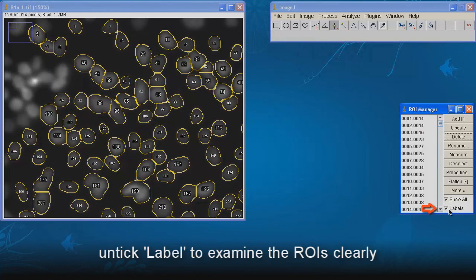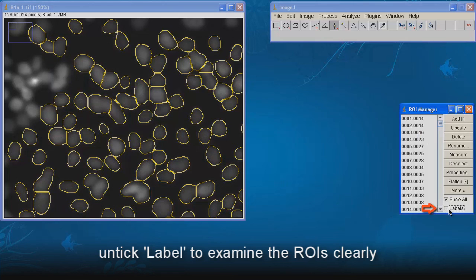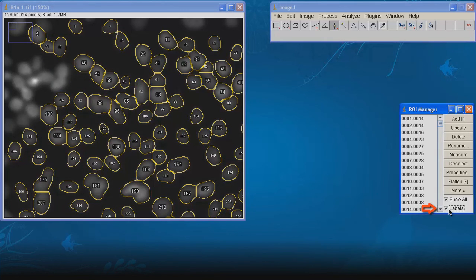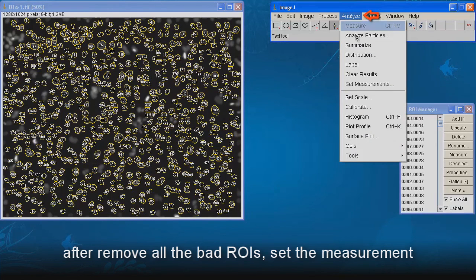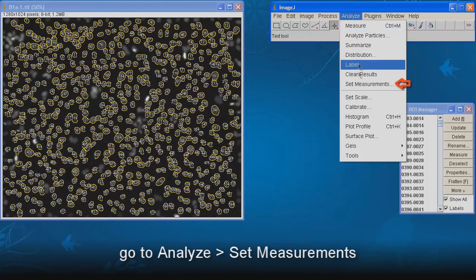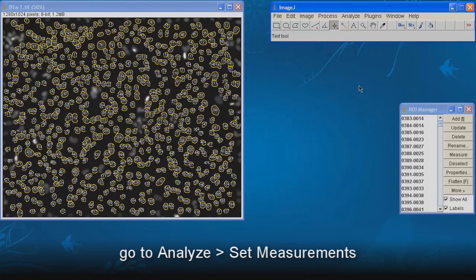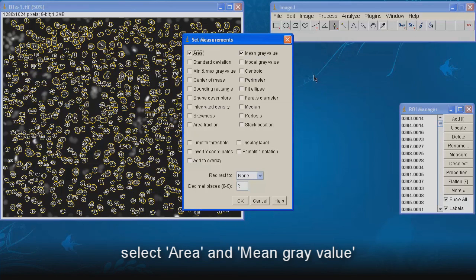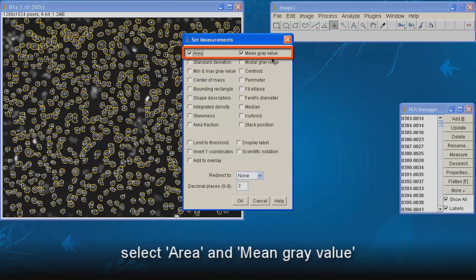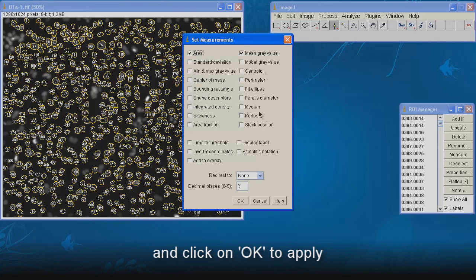Untick label to examine the ROI clearly. After removing all the bad ROI, set the measurement. Go to Analyze, Set Measurement. Select area and mean gray value. And click on OK to apply.